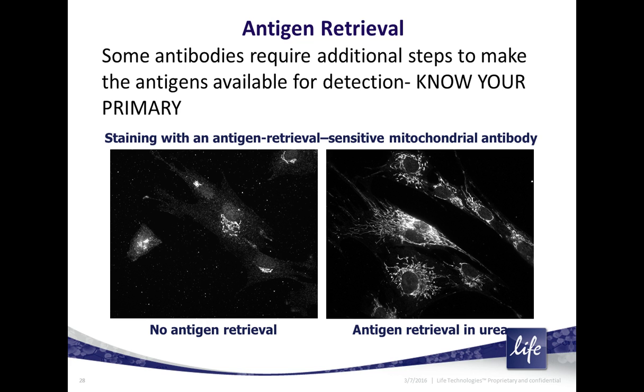Another question here is the appropriate speed and time to centrifuge the primary. Again, just bring it up to full speed with a typical benchtop centrifuge, and then let it come back down and use the supernatant. If you see a really big pellet, then chances are your antibody is no longer stable. But if it's just a little bit at the bottom, then I wouldn't be too concerned.